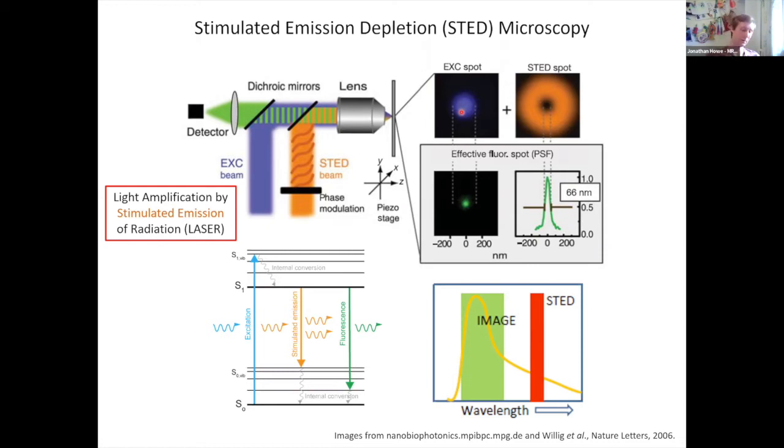And then the photomultiplier tubes or whatever detectors you're using record the signal, and that signal is attributed to the location where the scan mirrors are pointing in order to build up the image. And normally your excitation spot would generate an emission spot which is more or less the same size, slightly larger because of the longer wavelength. But instead, we obviously want to somehow make that emission spot smaller.